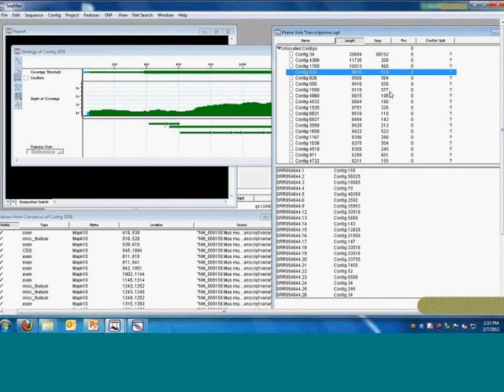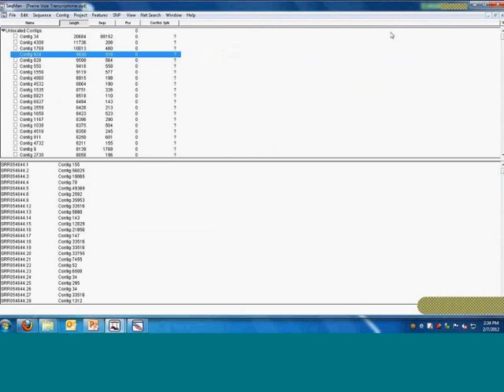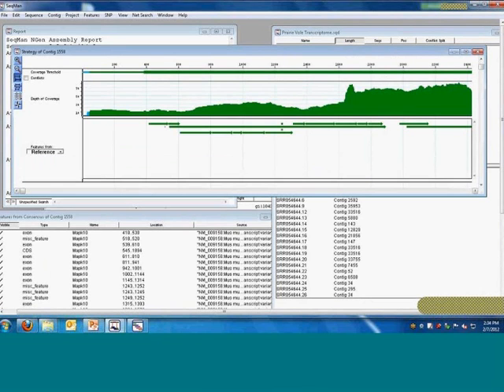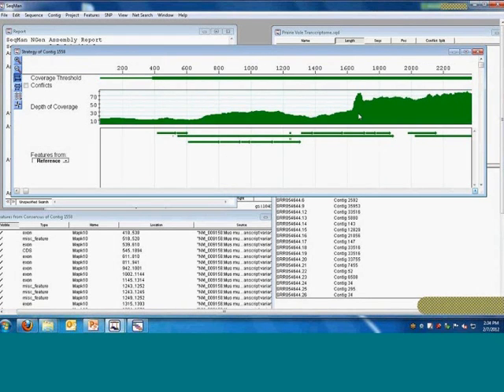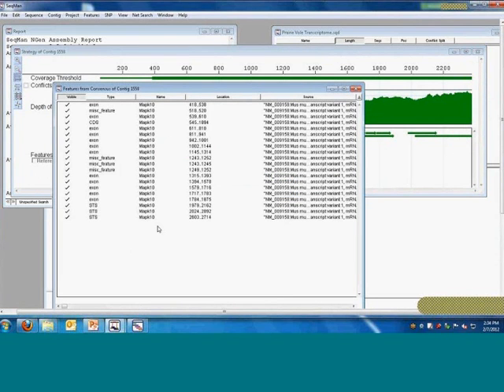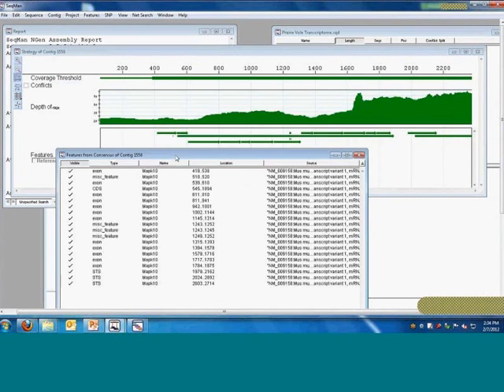Transcriptome assemblies in particular can be very, very challenging because they can have many different isoforms that are similar to each other. I can set parameters to either separate them or cluster them together. And once I have these clusters, we can do things like the rolling batch blast again. The batch blast allows me to bring in annotations. And so here is a strategy view now of a single cluster, a single mRNA. I've imported annotations. I can see my coverage plot across, and I also have a feature list now that I've imported for this transcript.